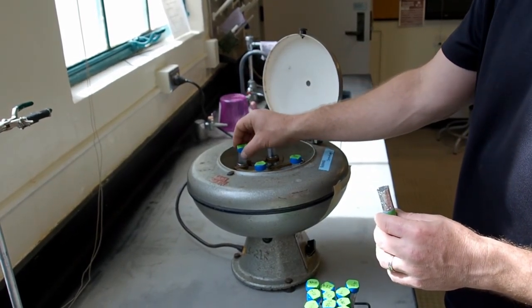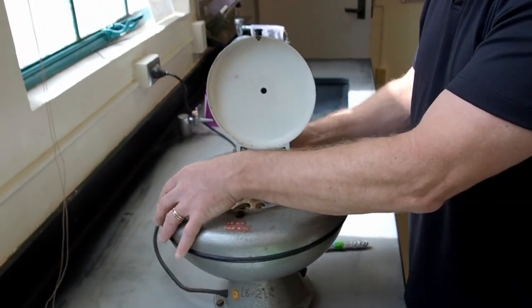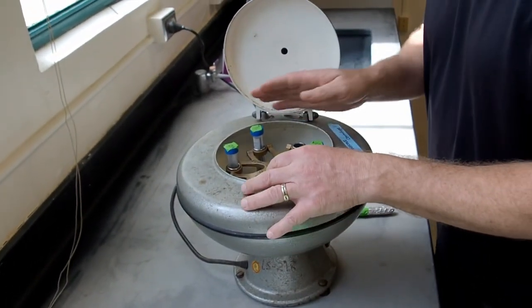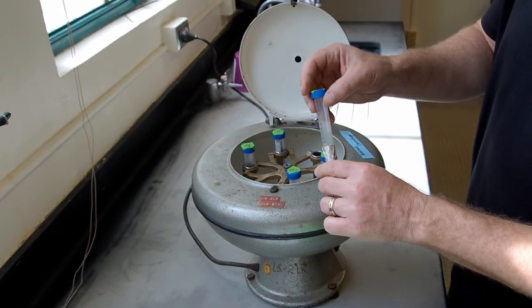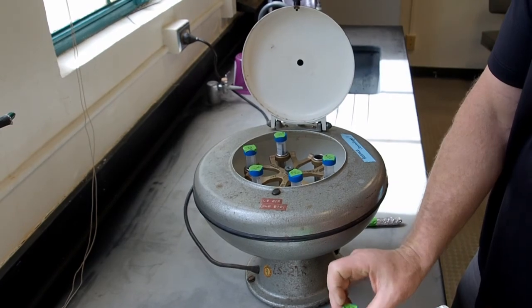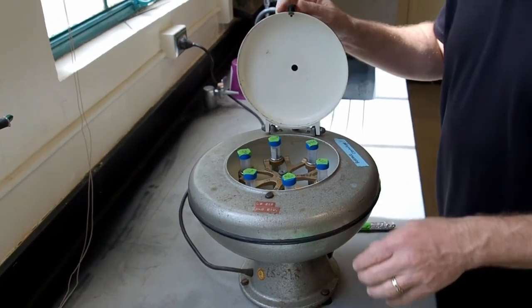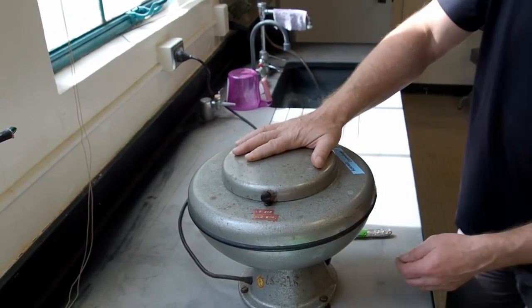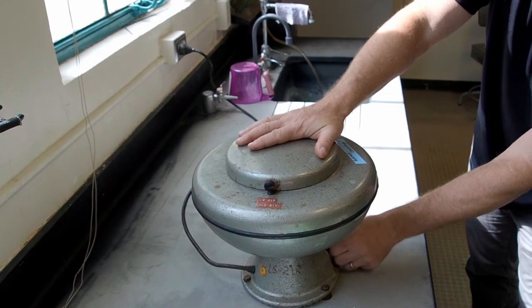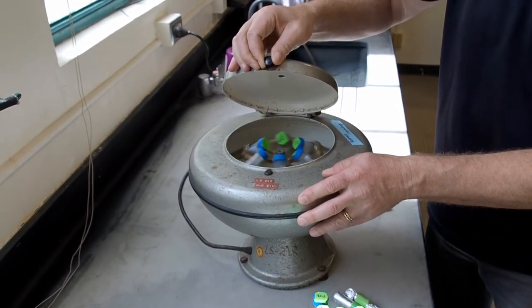The most important thing about using a centrifuge is to make sure it's balanced. So we've got 4 samples here in our tubes, and they're across from each other, so they're balanced. And just for safety's sake, I'm actually going to fill up every chamber here and make sure this is completely balanced, so that when it spins, there's no issues with it wobbling. So there's our samples in there. We're going to turn our centrifuge on. Down here, I can show you that it's spinning right now.